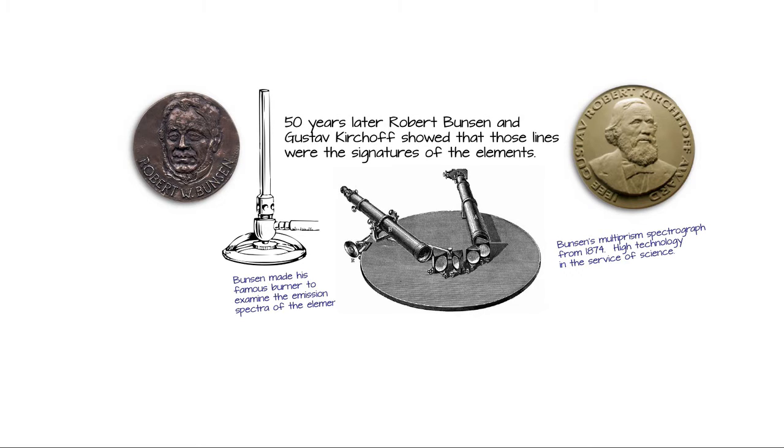There's his spectrometer from 1874. It's a collimator that will take the light in from the burning flame where you might have sprinkled some sodium to get the emission lines, and then you go through that series of quartz prisms, and then you're able to use a precision telescope and measure the angle and get the exact position of the line. They didn't understand wavelengths or frequencies back then, but certainly you could get the exact position of the line.